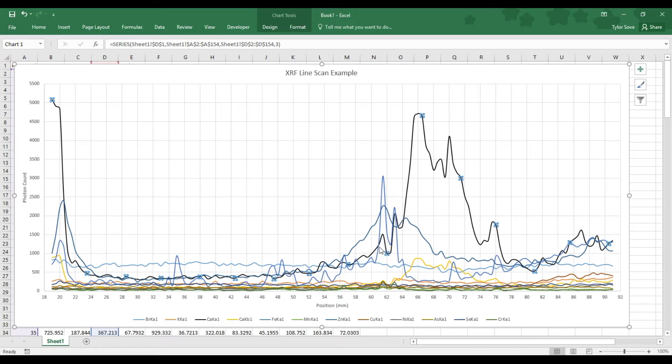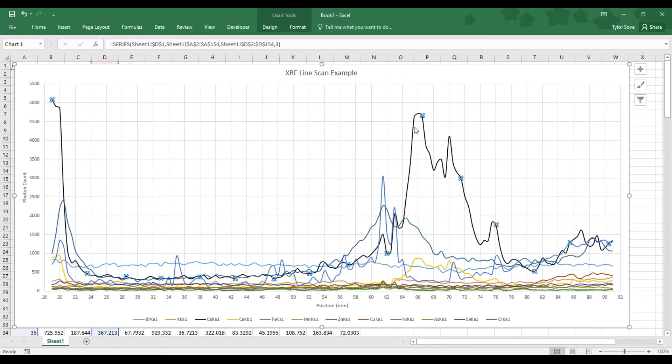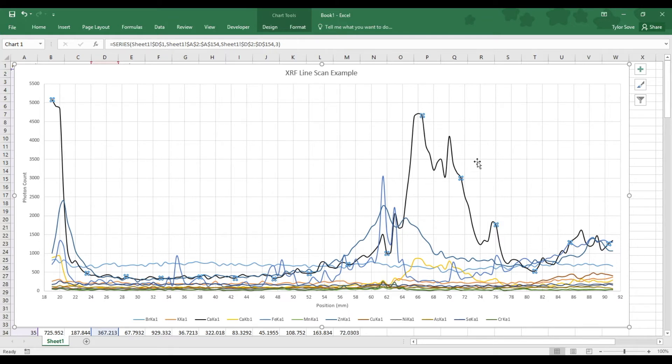At roughly the 60 millimeter position, it starts to peak up a lot faster. At the 64 millimeter position, the concentration of calcium rises rather abruptly. For the next 10 millimeters or so, the concentration oscillates back and forth but follows a general trend downwards.